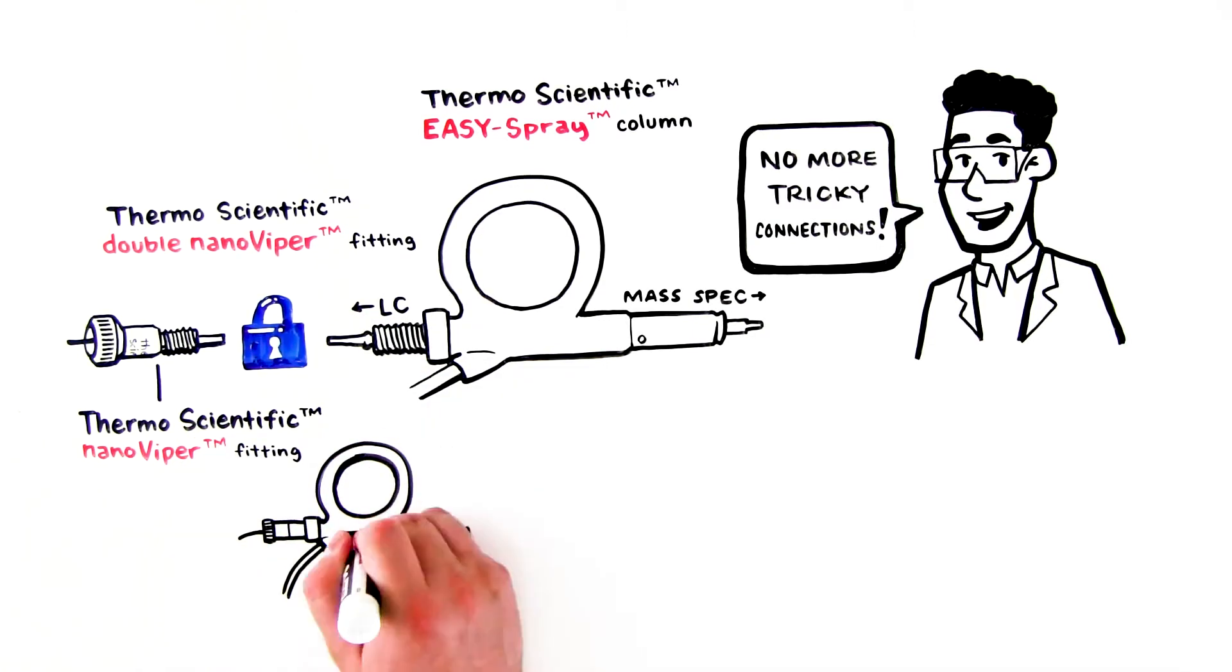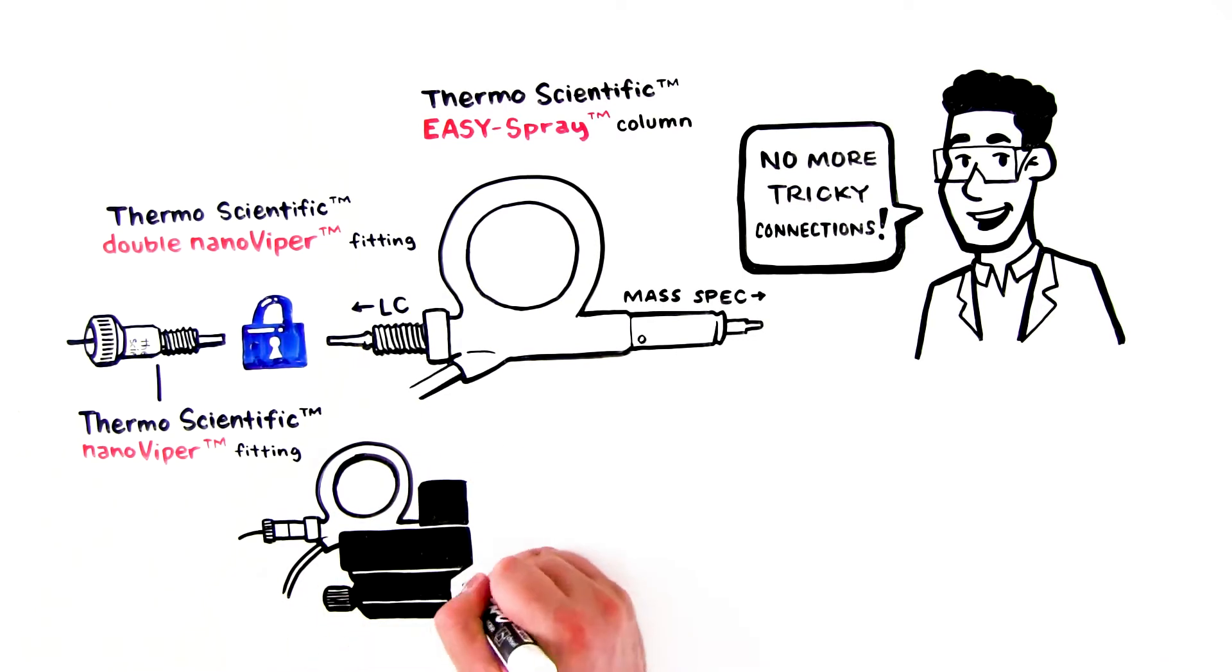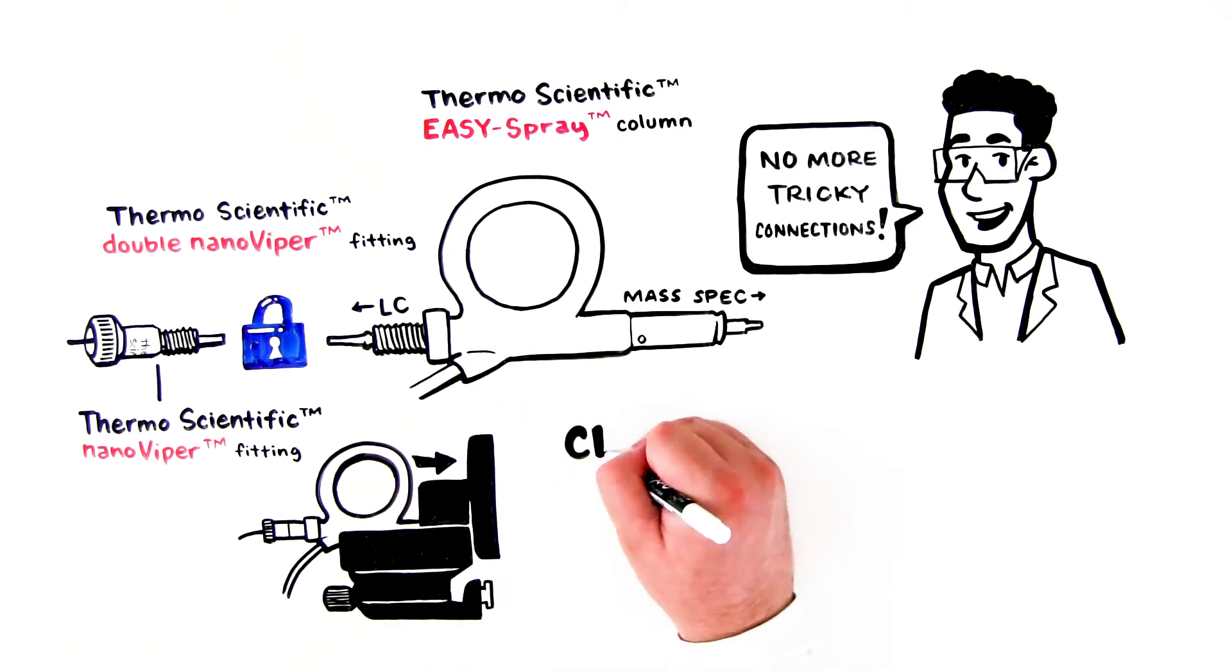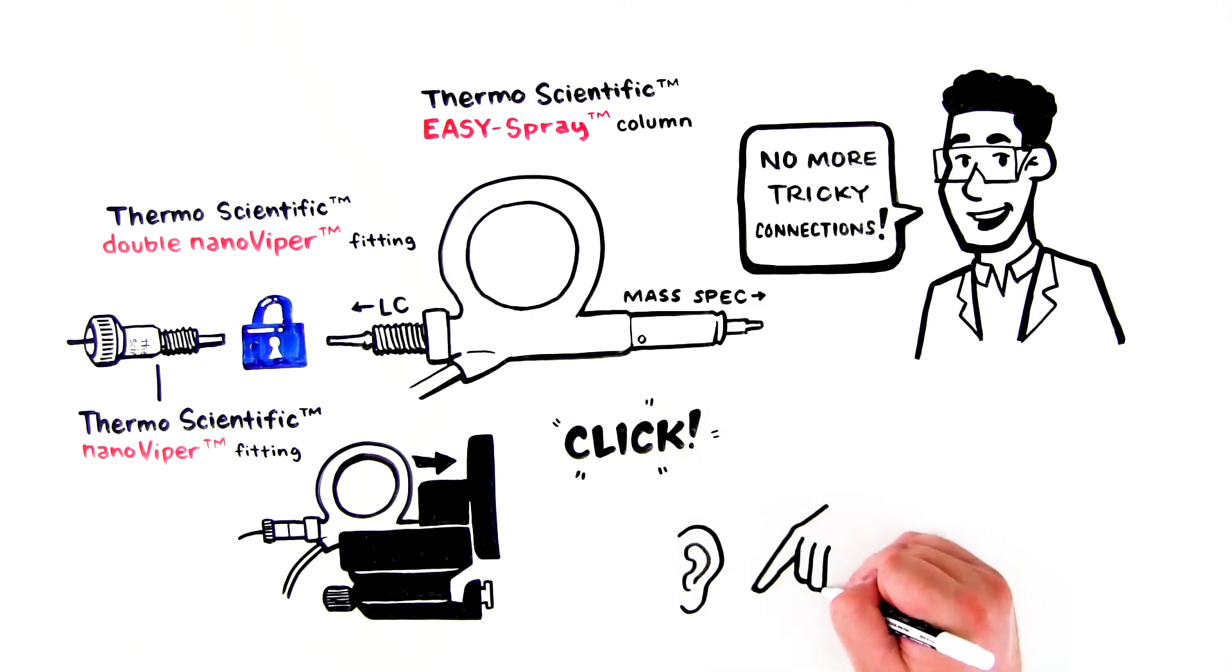The second connection is to the mass spectrometer's Easy Spray source. The innovative design allows the column to simply click into place. The click can be both heard and felt, so you know the connection has been made correctly.